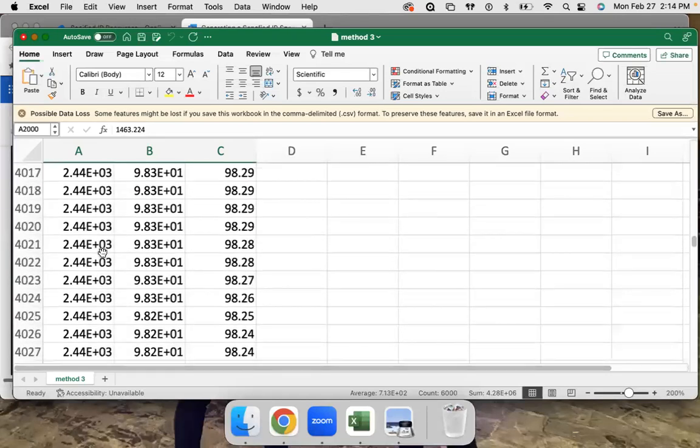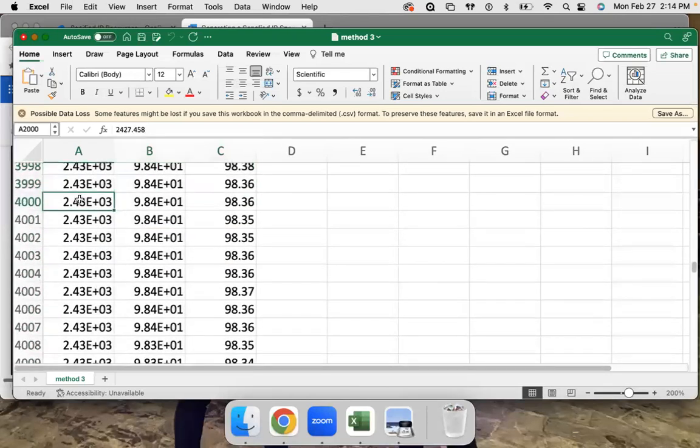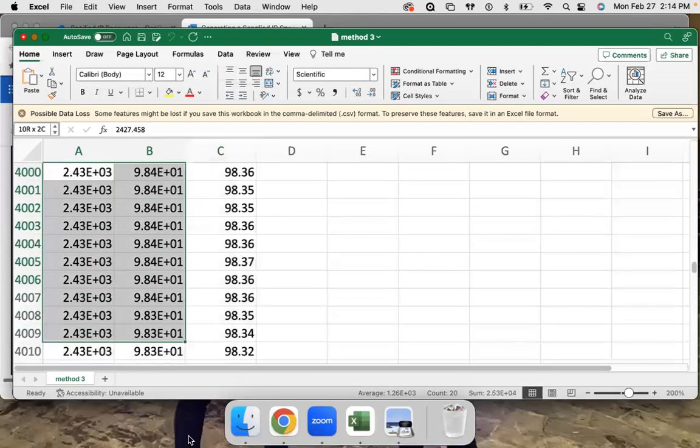Next, we're going to do that again from 4,000 to 5,999.